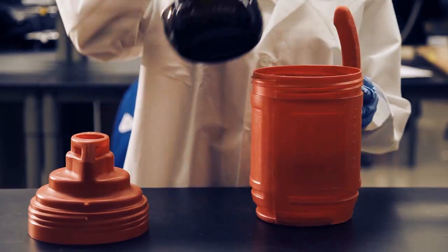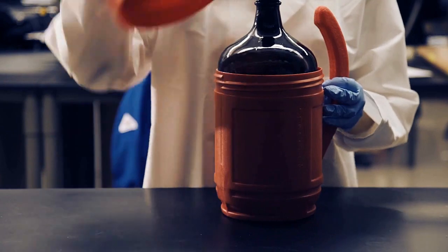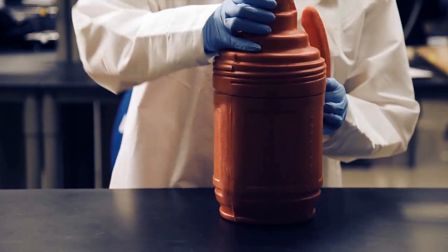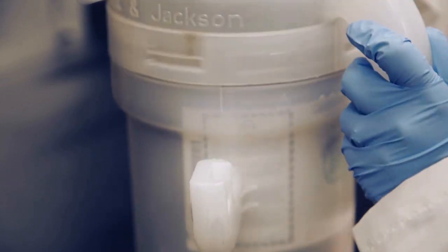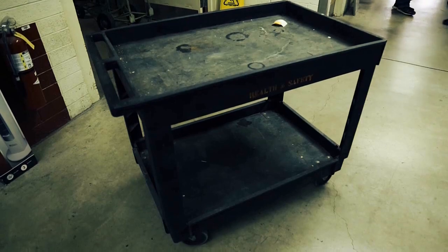All chemicals should be transported within secondary containers capable of holding all materials in the event of a spill. Acceptable secondary containers include plastic bottle carriers with closed tops and handles or non-metal liquid-tight carts with lips on all four sides.